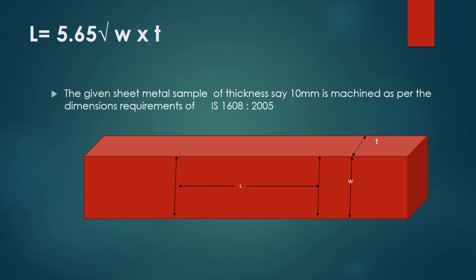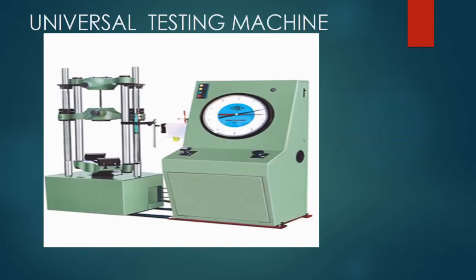The load is applied at a rate of 140 kilograms per minute. This is the universal testing machine. This machine functions on the principles of Pascal's law, where oil is sent through a small orifice and the bigger piston is floating. The bigger piston is the UTM table, and the UTM table carries the frame. The center grip is movable from top to bottom. The specimen of interest is placed in between the upper grip and the middle grip, and the load is applied slowly using valve V2, on the right-hand side, at a rate of 140 kilograms per minute.